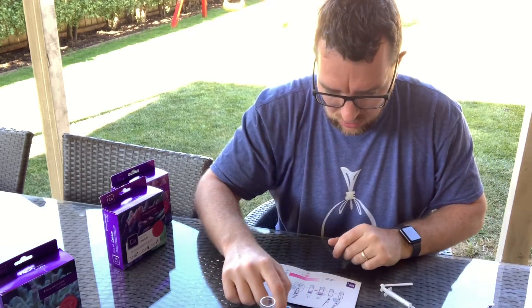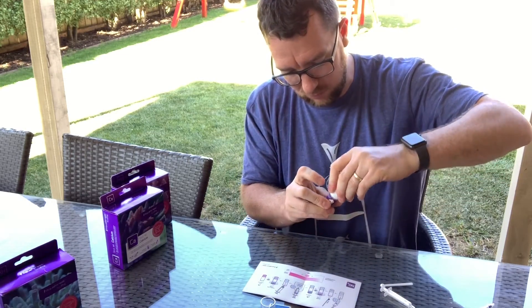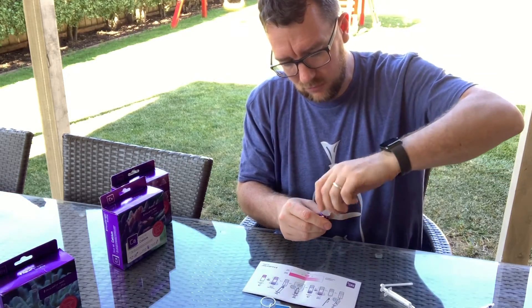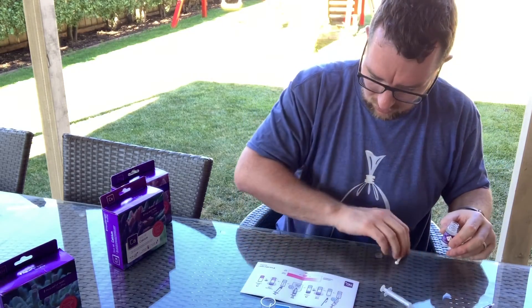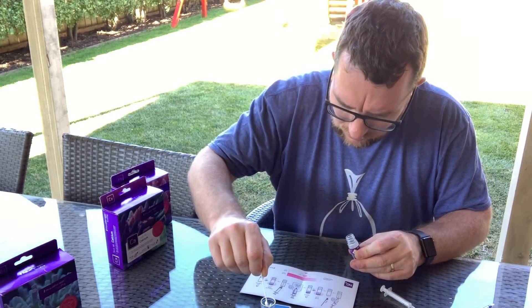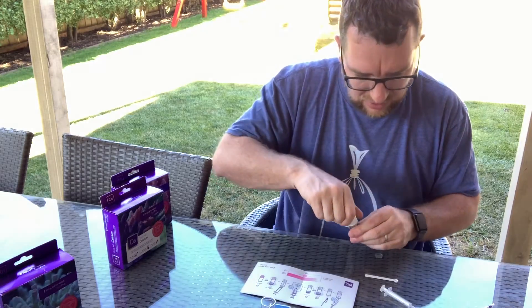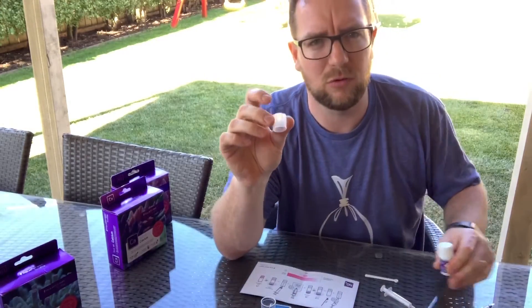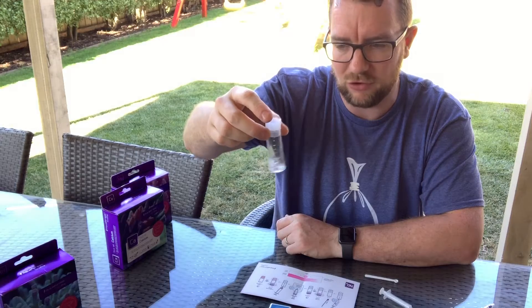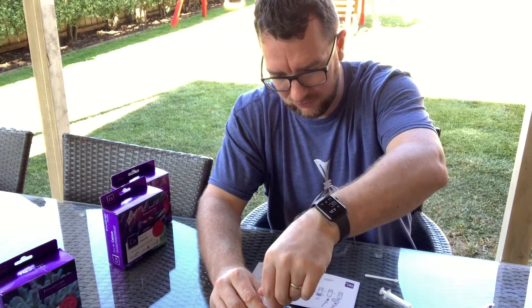So that's one milliliter of water in, get that stirring. Now we need Reagent A — it has a childproof lock, which tells me this stuff is probably pretty dangerous; it does have a big warning label. I need one spoon of this powder, which like I mentioned is quite fine, which is good. Pour that in — the speed stirrer is going to eat that up. They also give you handy little stoppers for the top of the vial so you can give it a vigorous stir without worrying about it coming out.